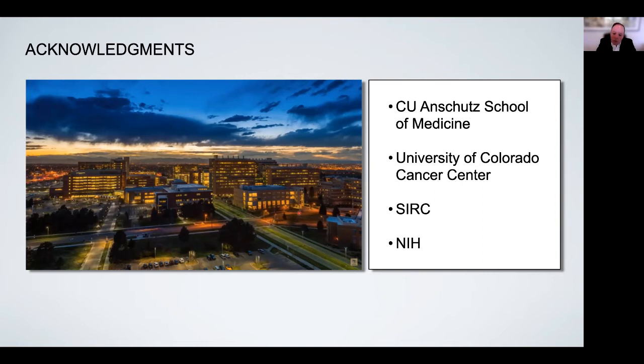Now, if you are talking about high resolution analysis by CryoEM, that is a different ballgame. Sample preparation is more involved. Data collection is also more involved. And depending on the quality and amount of the specimen, that could take anywhere from a week to a few months, depending on the amount of data that you have to collect, how well behaved your complex is, how complicated data analysis turns out to be for that sample.